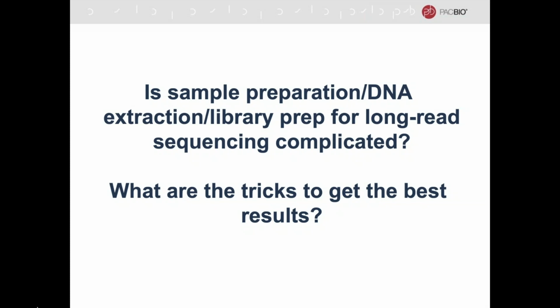The NanoDrop instruments quantify any nucleotide in a solution, so that would include any fragmented, nicked, degraded material, primers, the NTPs from a PCR. So really choosing the right QC method is frustrating both for users as well as us operating the system. If you think you're submitting sufficient amounts of DNA, but really you're submitting far, far less because the QC methods are different between the groups. So don't hesitate when you're talking to service providers or talking to PacBio to really nail down the auxiliary support systems that will help you get and qualify your best samples.